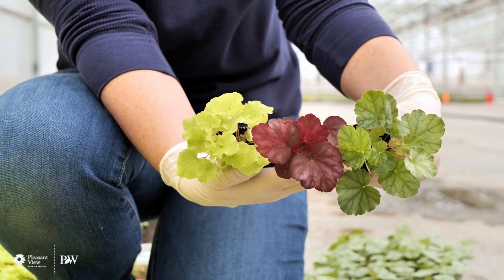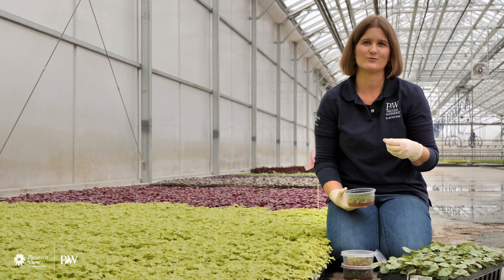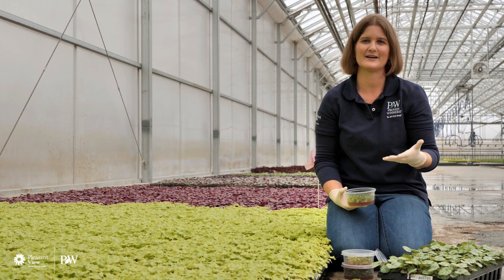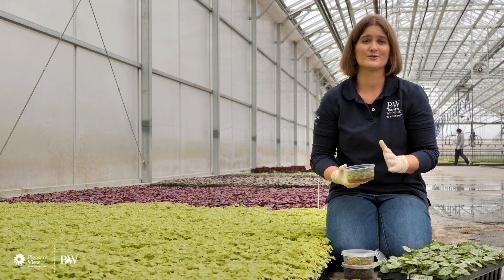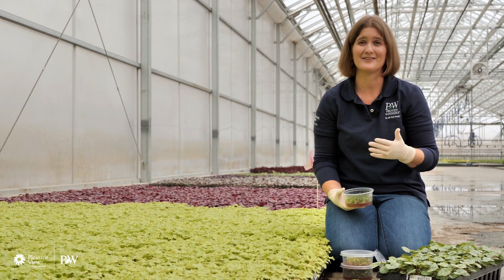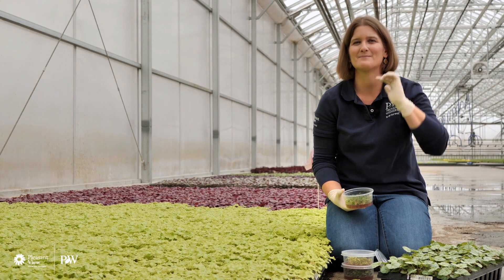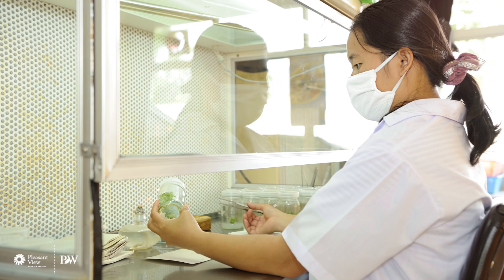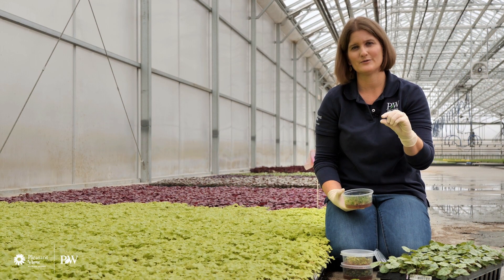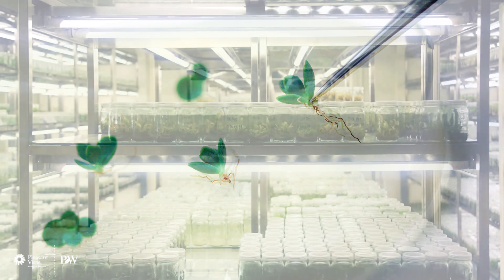The tissue culture process has four stages. The first stage is initiation, where we take plant material from the mother plant — whether it's the meristem, which is the very tiniest of the growing tips, or a section of the leaf — and get it sterile and into the first solution. You can multiply plants just from plant cells, kind of like a lizard regrowing its tail. Depending on the hormones you give the cells, they can turn into roots or shoots. Stage two is the multiplication stage, where we're proliferating all of the shoots.